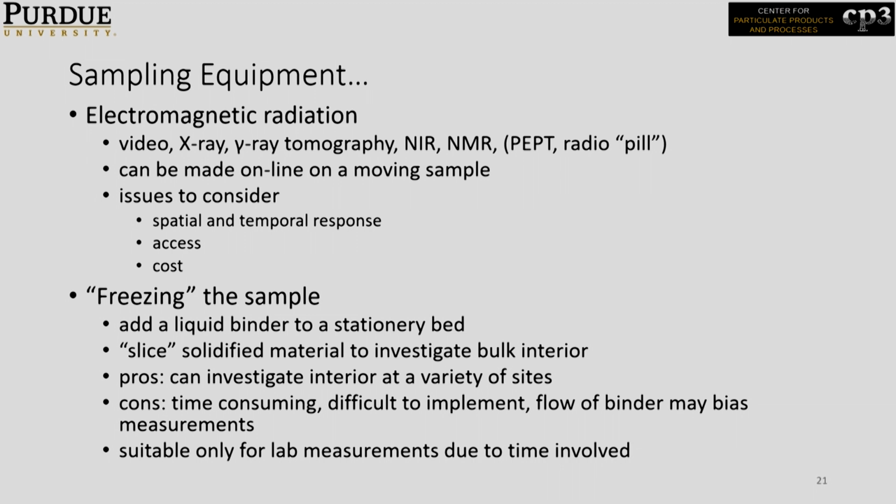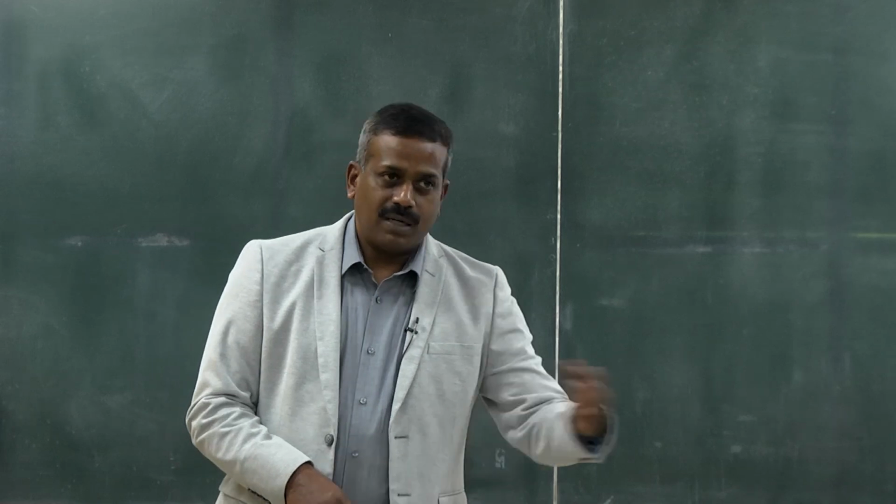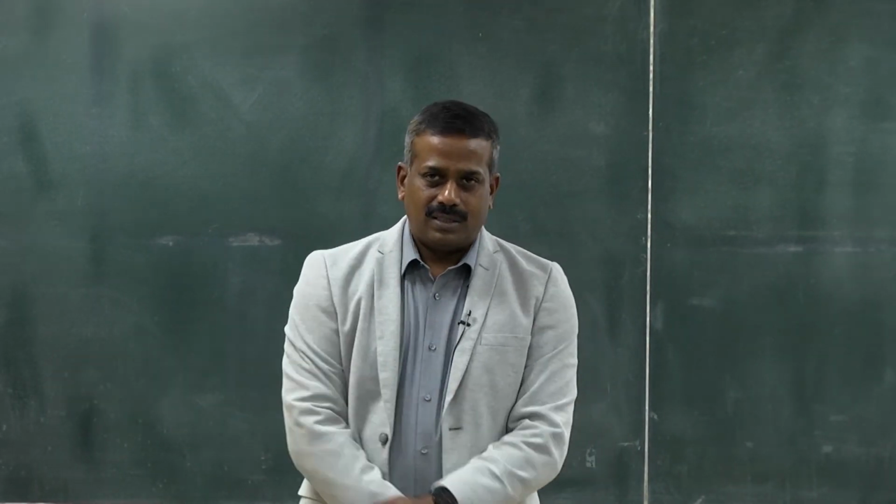Freezing, again, adding liquid binder, then freezing that portion and cutting it, so that you save the integrity of the sample till you analyze. You are not adding any additional segregation, you are not breaking the sample, etc., while handling and taking it to the measurement unit.